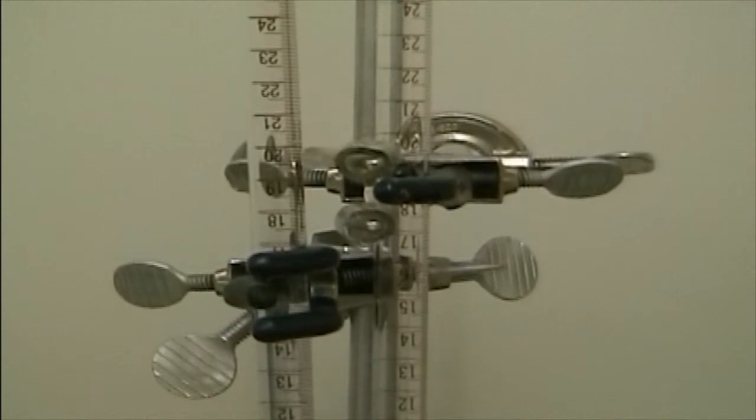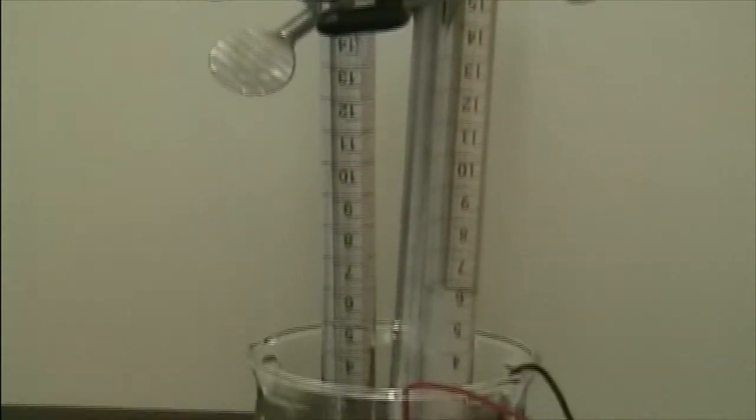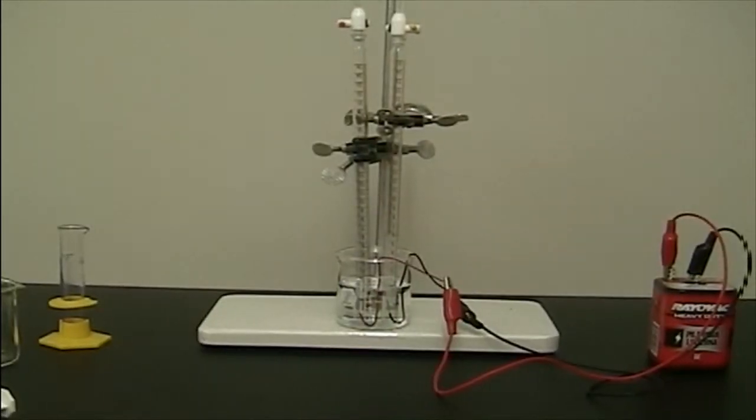Gaseous evolution was instantly seen emanating from the submerged ends of the copper electrodes at the base of each burette. After about 10 to 15 minutes, enough hydrogen and oxygen gases had evolved so that their 2-to-1 relative volumes could be clearly observed.